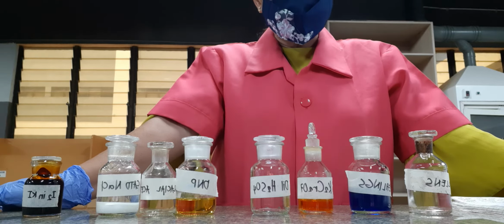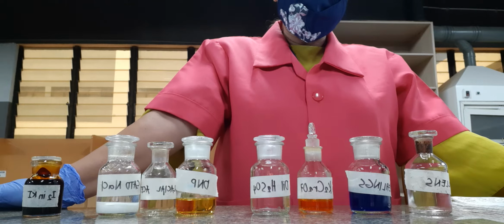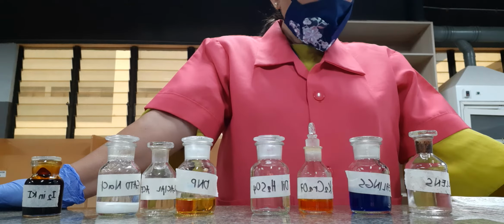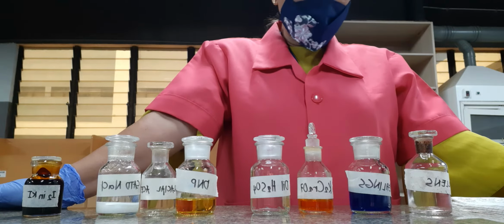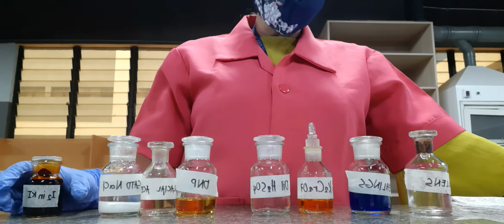In your lab manual you have acetaldehyde, acetone, benzaldehyde, ethanol, tert-butyl alcohol, and then a blank of water.